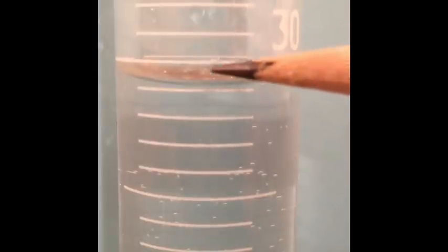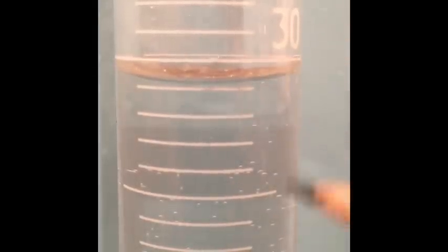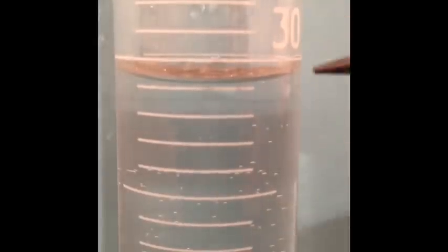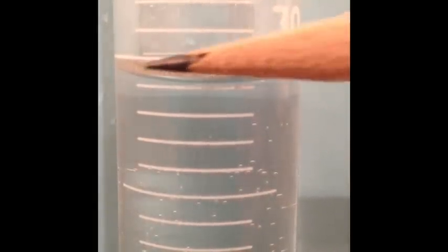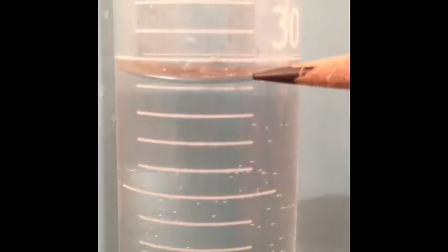It looks like the level of the water is up here, but this is actually empty space. We have to look for the bottom of that curve. That curve is called the meniscus, and we're looking for the bottom of that curve right here. We don't want to be up here because that's not actually the level of water that we have. We need to be at the bottom of the curve.